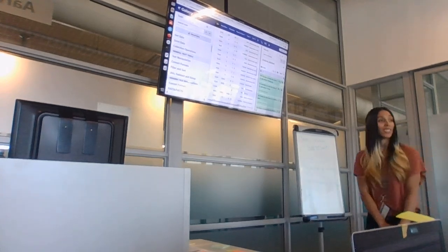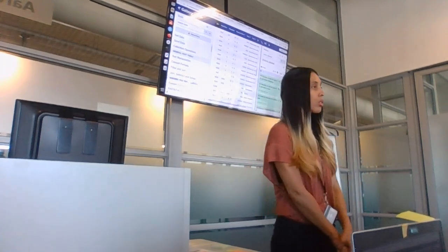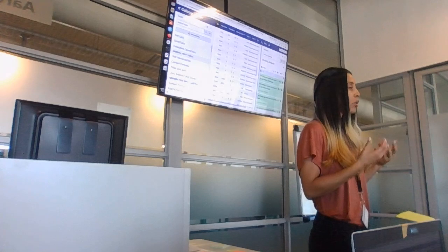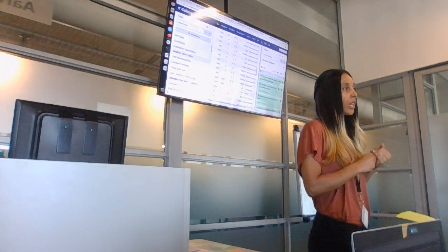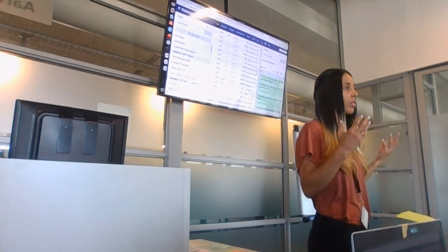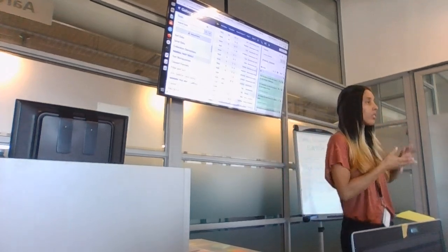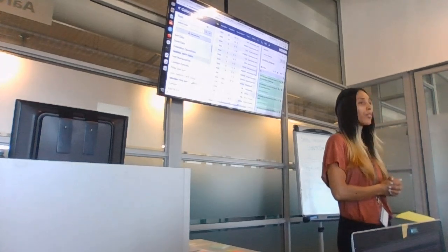Must I give clues again? No, I'm asking the name. You have to decide. Anything. Well, it's going to have to be something that if you were to click on your workflows button, you will know exactly what analysis it is. So you need to name it something that makes sense to you. So if you want to do like cholera pre-processing reads or something like that, or you even could list the tools if you wanted to, FastP and MultiQC on cholera. Yeah, there we go. That's perfect.